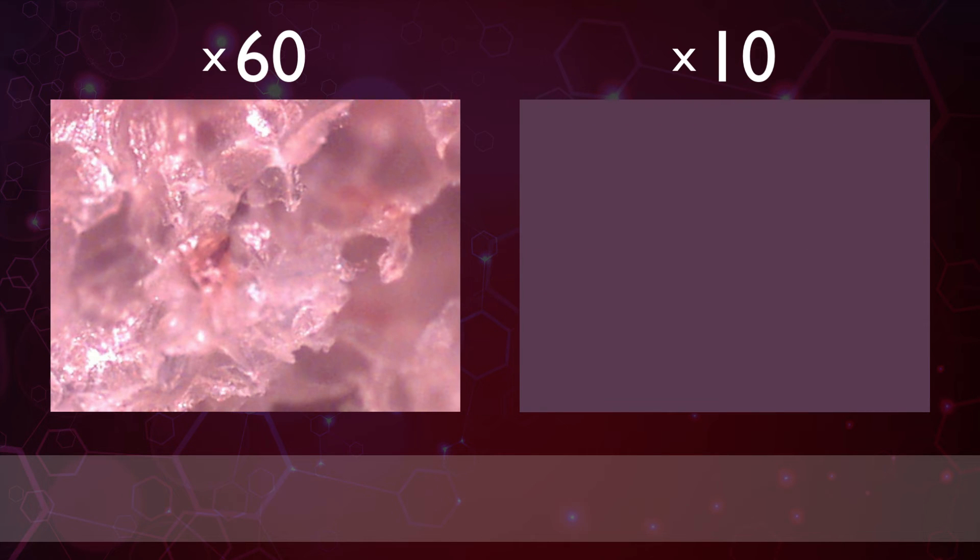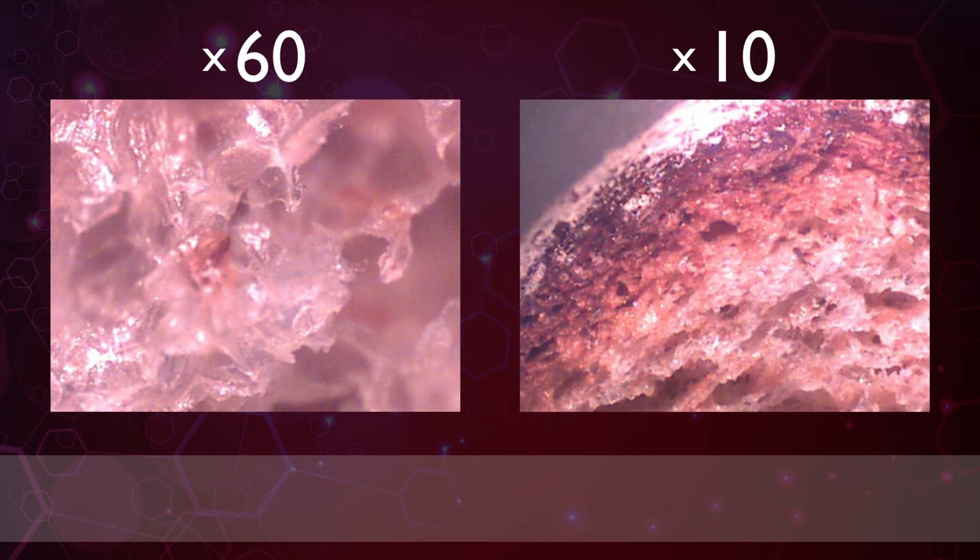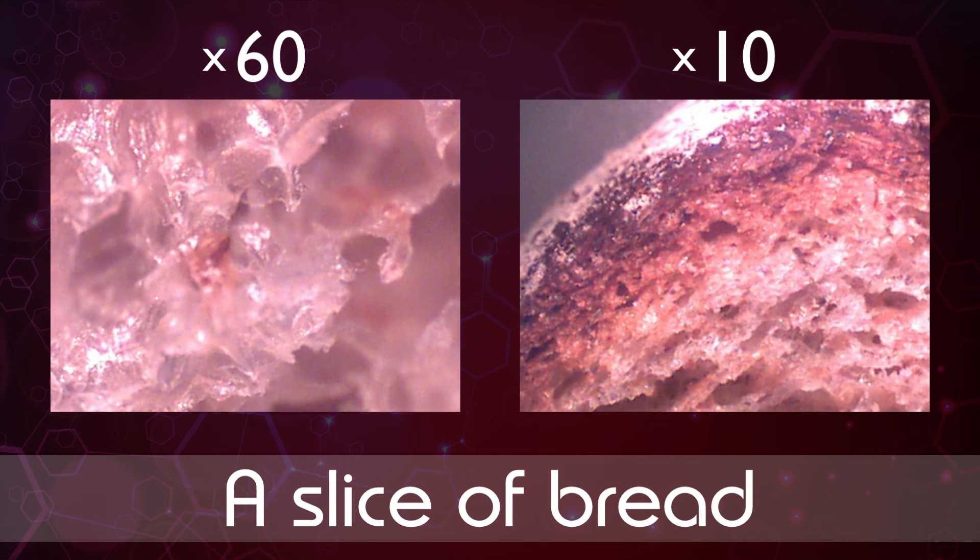The next one you can eat as well, although it doesn't look very appetizing at 60 times magnification. This should make things a little clearer — it's a slice of bread. And number nine is our last food item, another tricky one. Before you eat it though you'd need to add some hot water to it. Our last item of food is noodles.